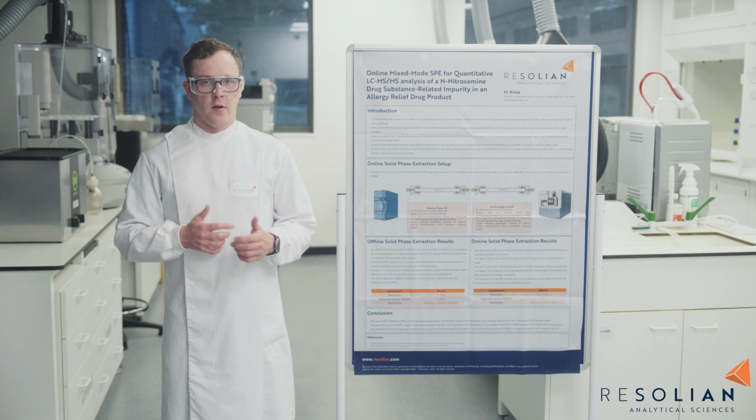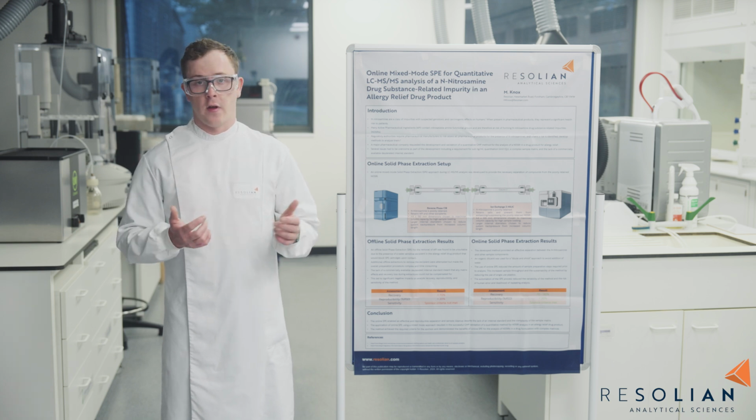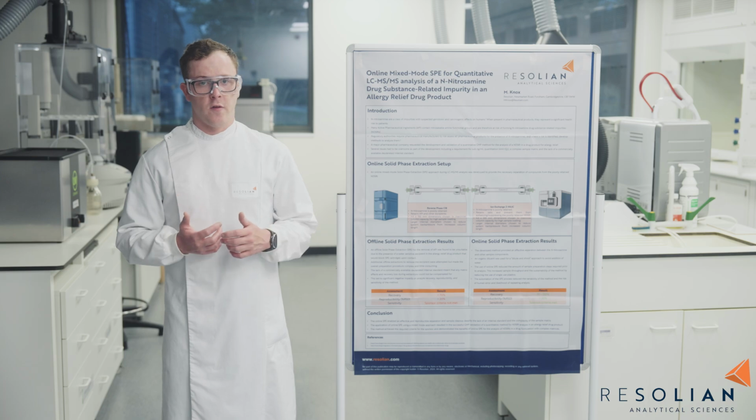So, comparing the offline SPE against the online SPE, we can see that the method is greatly improved by increased separation on the instrument. In conclusion, the online SPE enabled an effective and reproducible separation and sample cleanup, despite a lack of an internal standard and the complexity of the sample matrix.